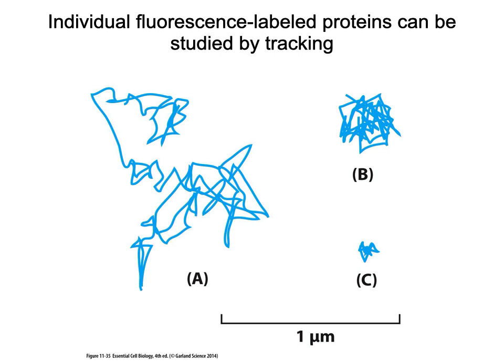It's going to be isolated in a smaller area. Now with panel C, what we're seeing is one that would be anchored most likely to the cytoskeleton. And so it's not going to be able to move freely at all. It's actually very limited, the most severely limited one. And so again, by looking at trafficking pattern, this can also tell us information about the protein.